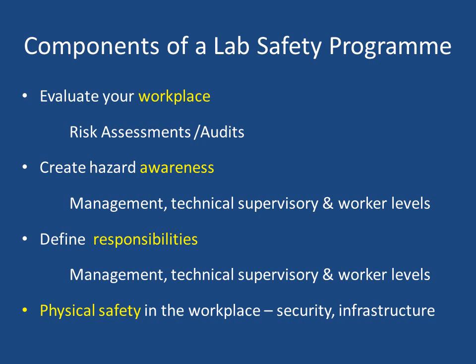The components of a laboratory safety program. First and foremost, evaluate the workplace. Perform risk assessments and conduct internal audits to identify problem areas before finding solutions. Create hazard awareness in the management, the technical and supervisory level, and worker levels.